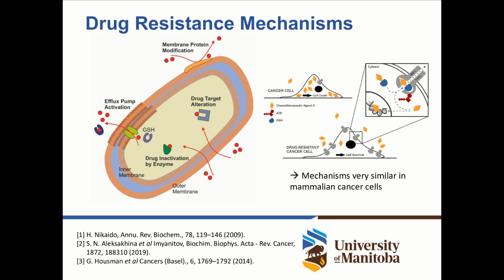There are also intracellular mechanisms, such as drug target alteration, where the drug cannot bind to its intended target, or drug inactivation by enzymes. And today I'm going to discuss how we can use electrochemistry to detect any of these mechanisms.